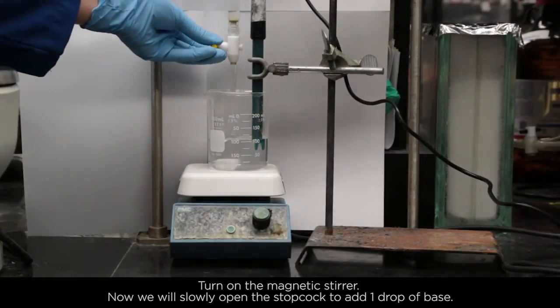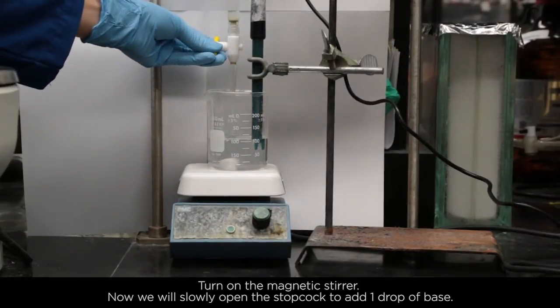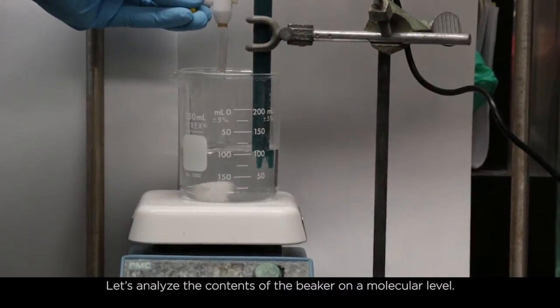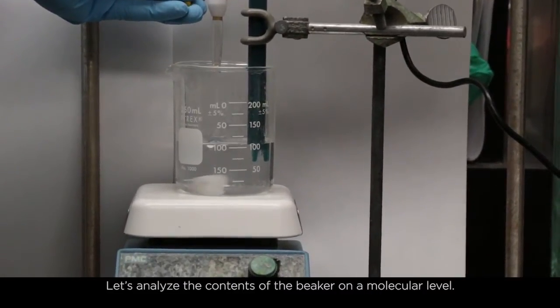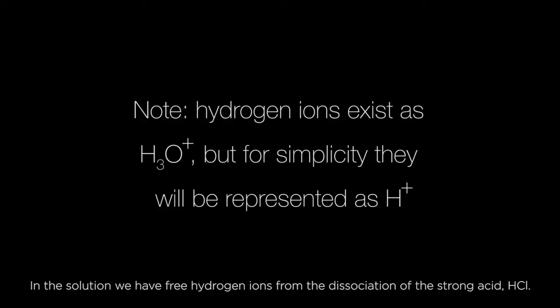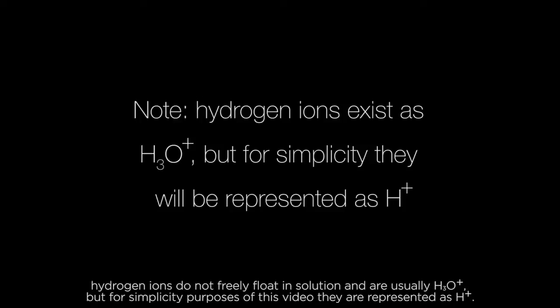Now we will slowly open the stopcock to add one drop of base. Let's analyze the contents of the beaker on a molecular level. In the solution, we have free hydrogen ions from the dissociation of the strong acid HCl. Hydrogen ions do not freely flow in solution and are usually H3O+, but for simplicity purposes of this video, they are represented as H+.